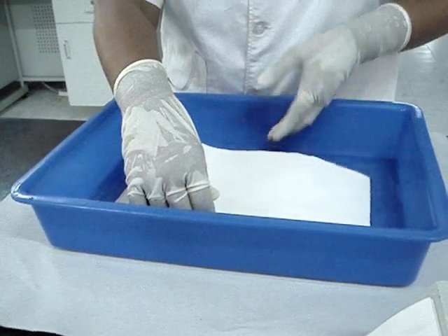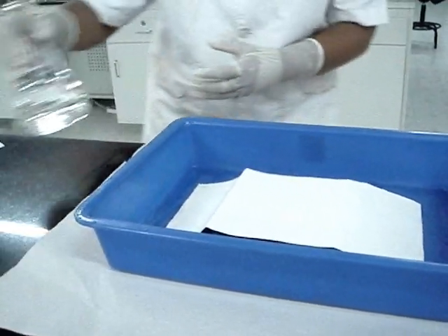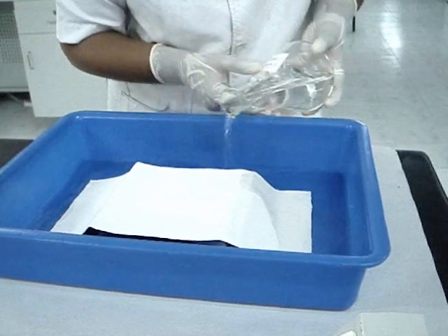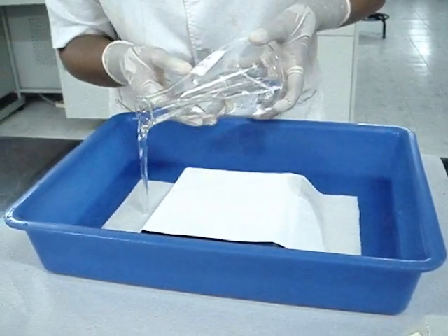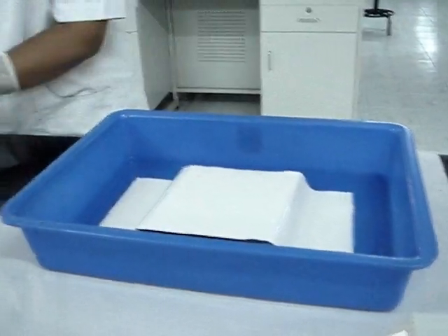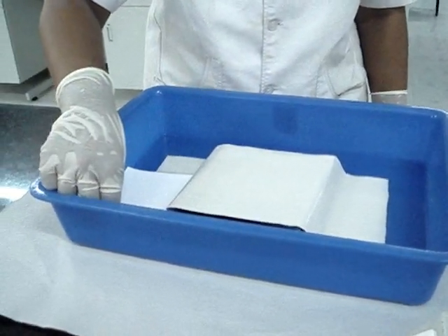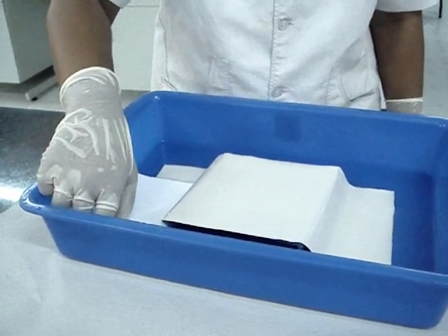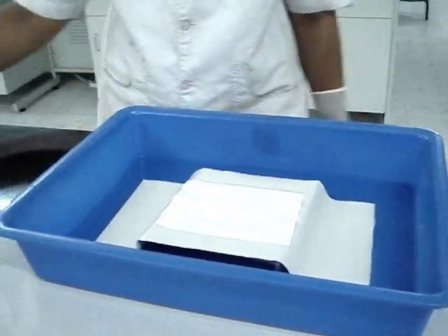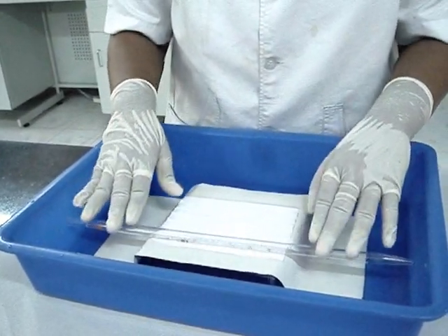Place the base with Whatman filter paper in the trough. Pour in the transfer buffer in such a way that the Whatman filter paper is wet with the transfer buffer. Take two filter papers, cut to the size of the gel, wet them with the transfer buffer and place them on the base. Remove any air bubbles that are caught between the layers.